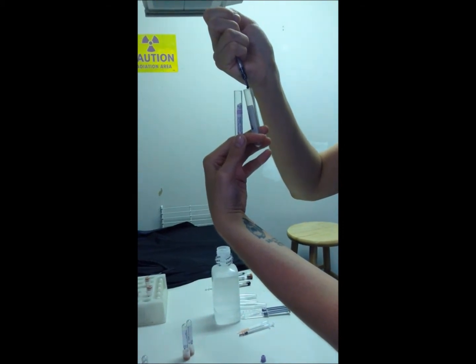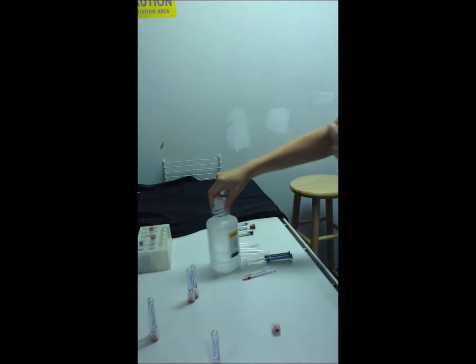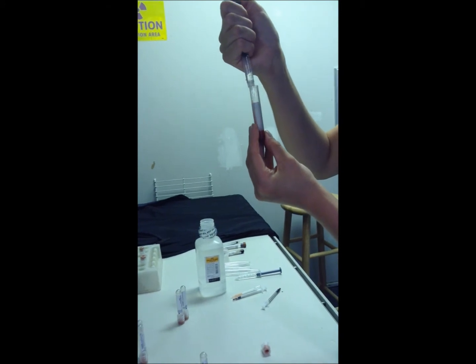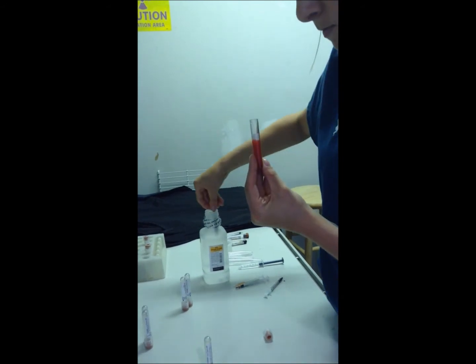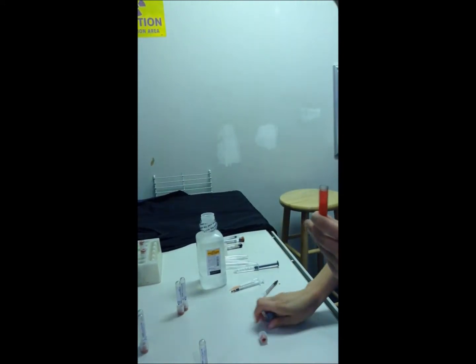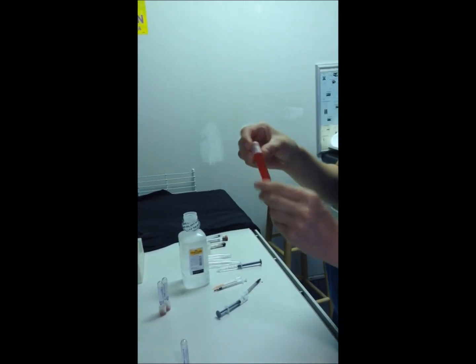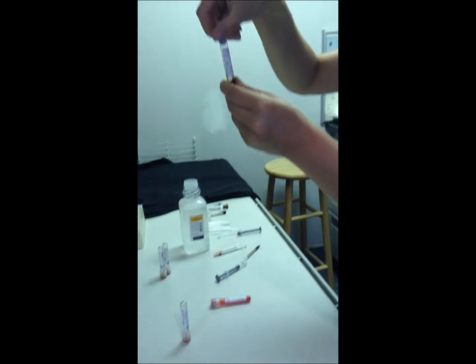One, two, okay, and then we're going to fill the rest of this vial up with sodium chloride. And we'll gently mix it. And then we're going to spin that down. We're going to do the same thing for Ethel's.